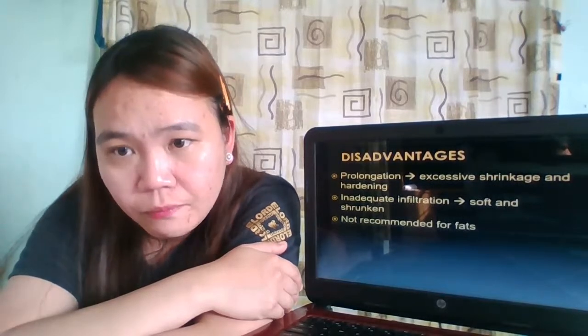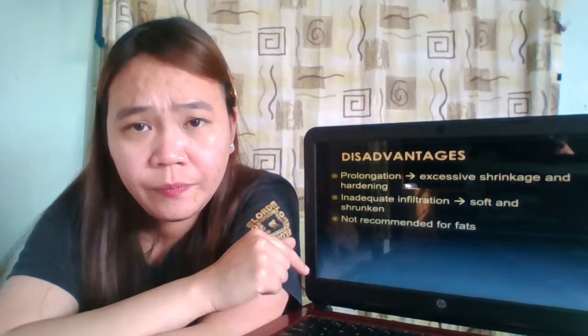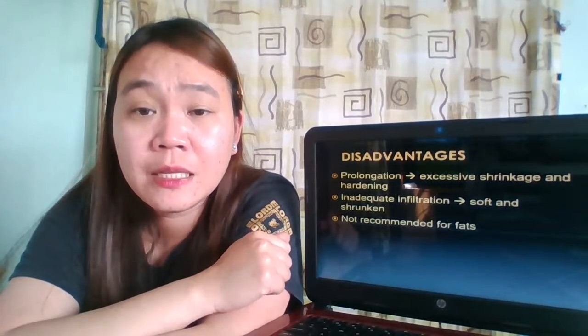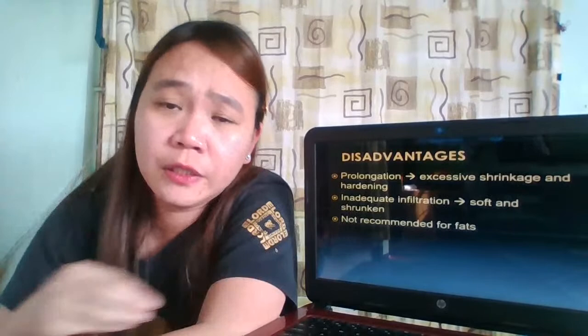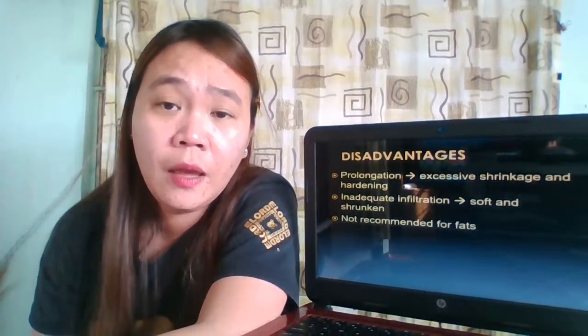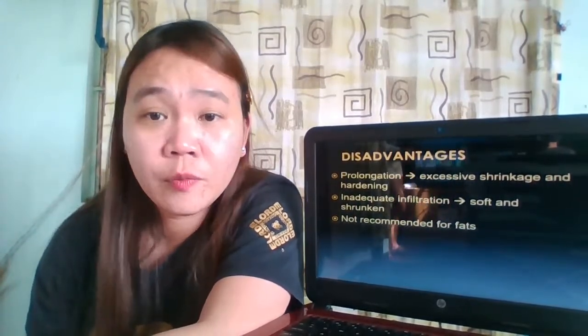Remember, what step did we perform before this one, before paraffin impregnation? It's clearing. Okay, and what is the requirement as for the reagents that you use in clearing and the reagent that you use in infiltration? These two reagents have to be compatible.